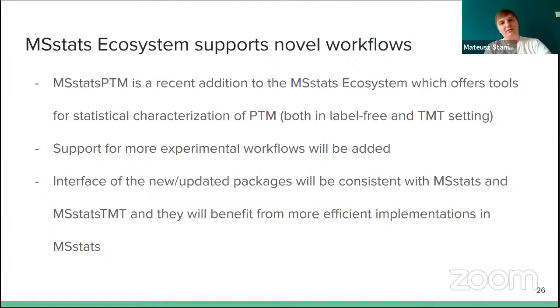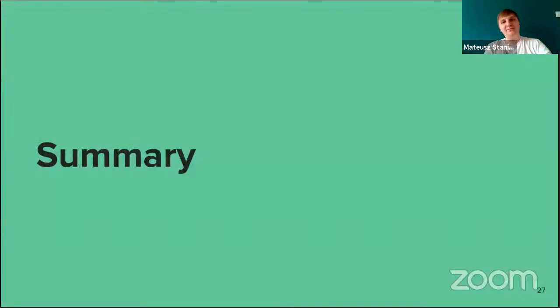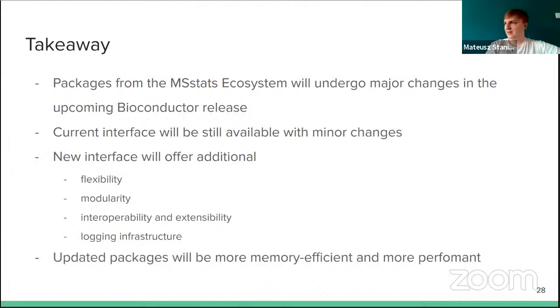And they will all benefit from interplay of different packages. Okay, so to summarize, and I have a few minutes for questions or discussions if you'd like. The takeaway is that the packages in the MSstats family will change a lot in May. The current interface will be minorly changed, but there will be many improvements in terms of modularity, extensibility, logging, and performance.